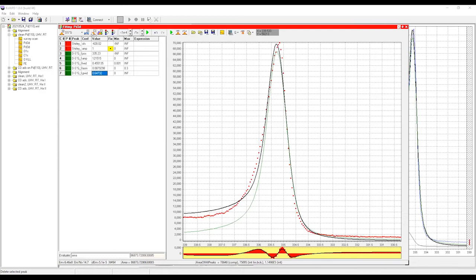Yeah, we clean the NAP cell by purging firstly with oxygen, between two experiments. If you have one experiment where at each step you use the same gas, you don't have much time to clean the cell every time. So you put the sample, you evacuate it, then you add another gas, and it goes like this.